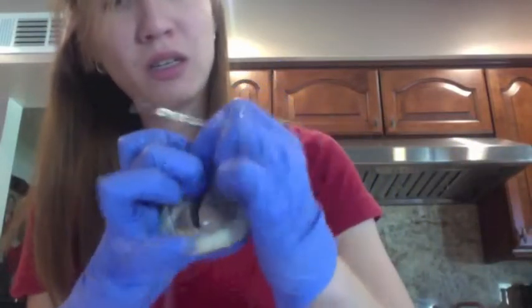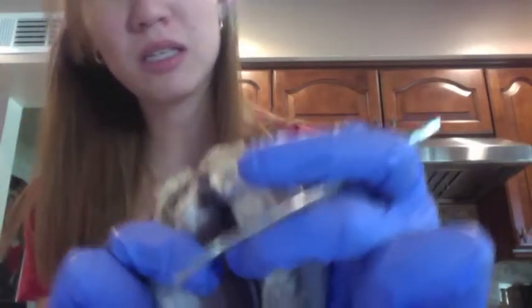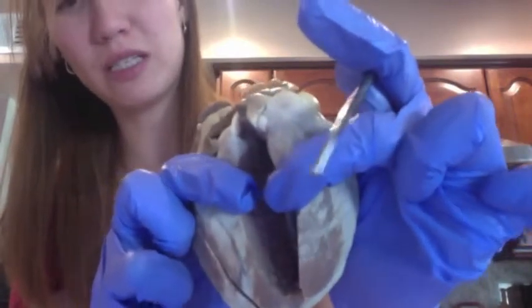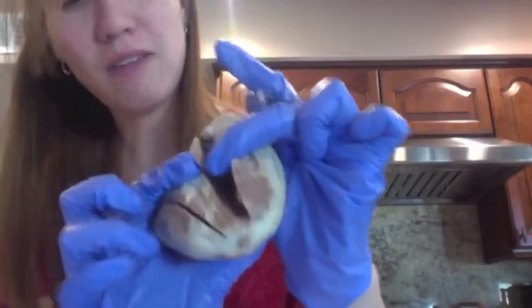That is the right, and this is the left one. If you can see, it's about 3 times thicker in the left than the right, and that's because the left ventricle has more of the oxygenated blood that goes through it.